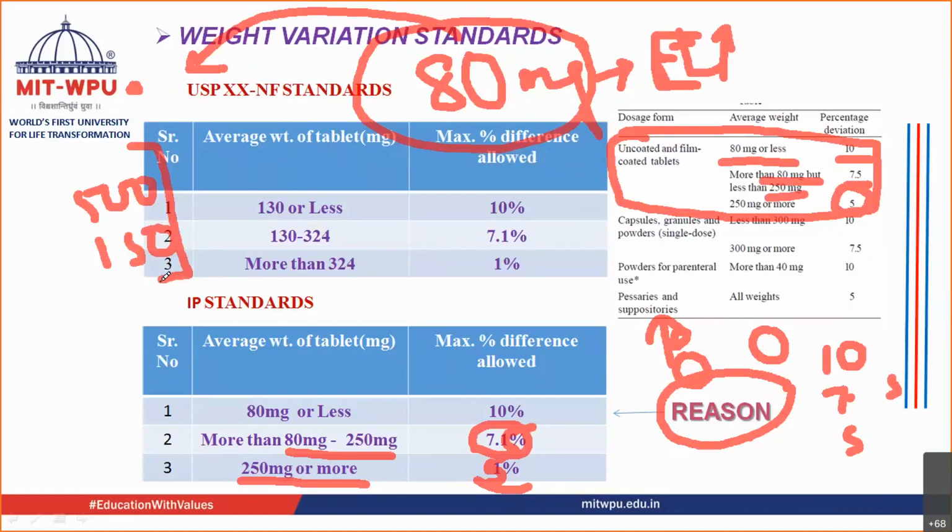Suyesh, can you tell me how much excipient you are going to add? More or less? Less excipient you are going to add.